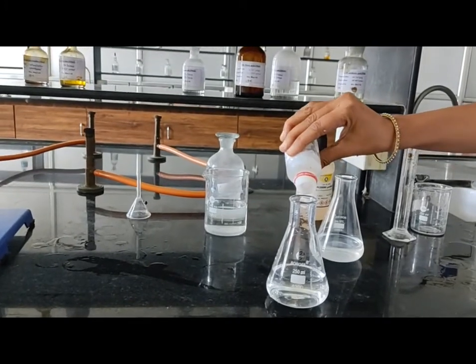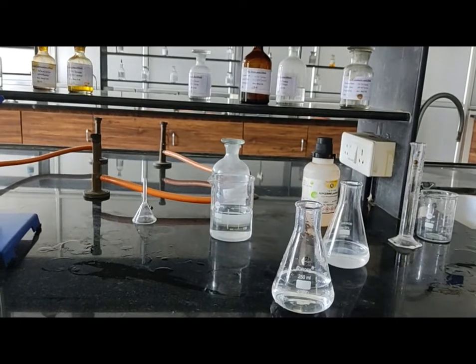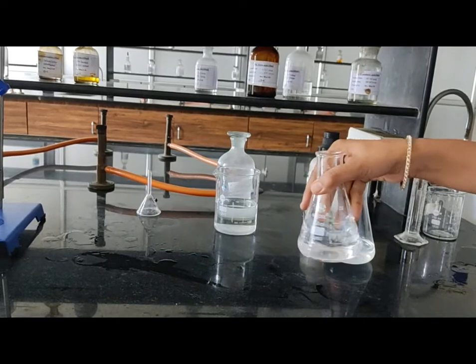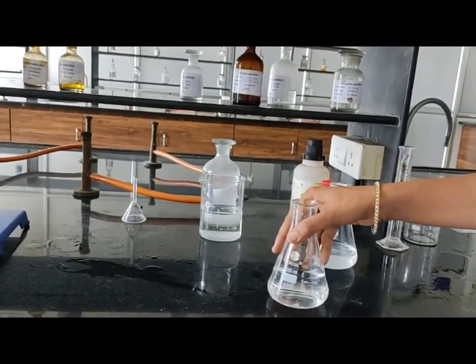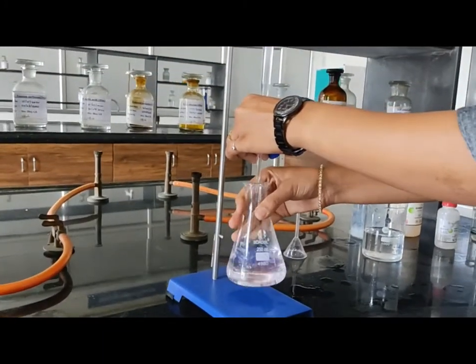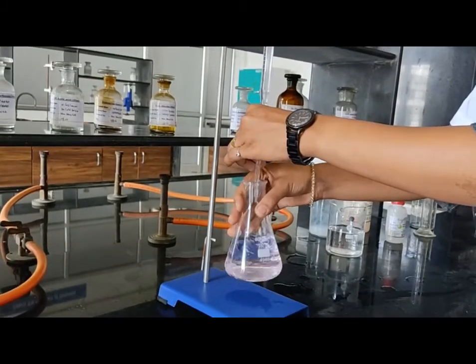Now add phenolphthalein indicator and titrate it against 1 molar sodium hydroxide solution. Titrate it with 1 molar sodium hydroxide solution.